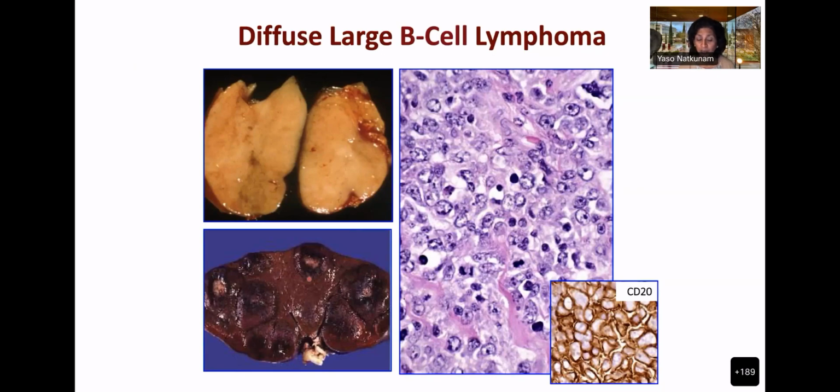And then in the spleen, one thing to know about when you are grossing a spleen, when it has large nodules like this, it's really easy to see them, but there is something called a miliary pattern. Sometimes you look at a cut surface of the spleen and you see just tiny little bumps and not these large nodules. That can happen in diffuse large B-cell lymphoma, and it can happen in classic Hodgkin lymphoma. So a spleen should be completely sliced fully and multiple sections taken per centimeter of the spleen, and that's typically how you gross it in. But when you see nodules, of course, you can nicely section them plus normal spleen for comparison.